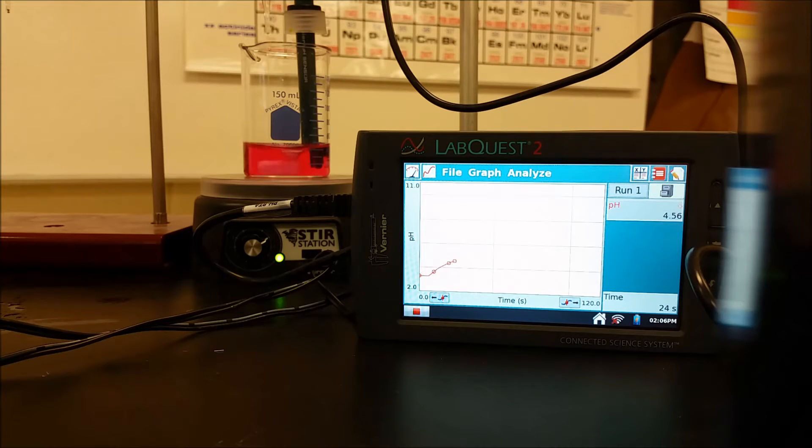Now at some point, the pH is going to be high enough where the color of the indicator is going to change. And that is called the endpoint of the titration. That's usually used when we don't have a pH indicator, like a meter like I have here, to tell us that the reaction is complete and equal amounts have been added.